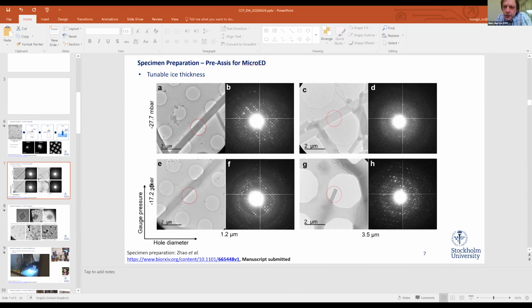Okay, thank you. So I think the final live question is from Jacob Brink: how do you reposition the crystal in defocused diffraction? I think that's what you're showing, every 10 images. Yeah. For the protein data set, we actually don't do this process. We collect around 15 to 20 degrees of a small wedge, and if we align the microscope properly, it shouldn't move away from the beam.